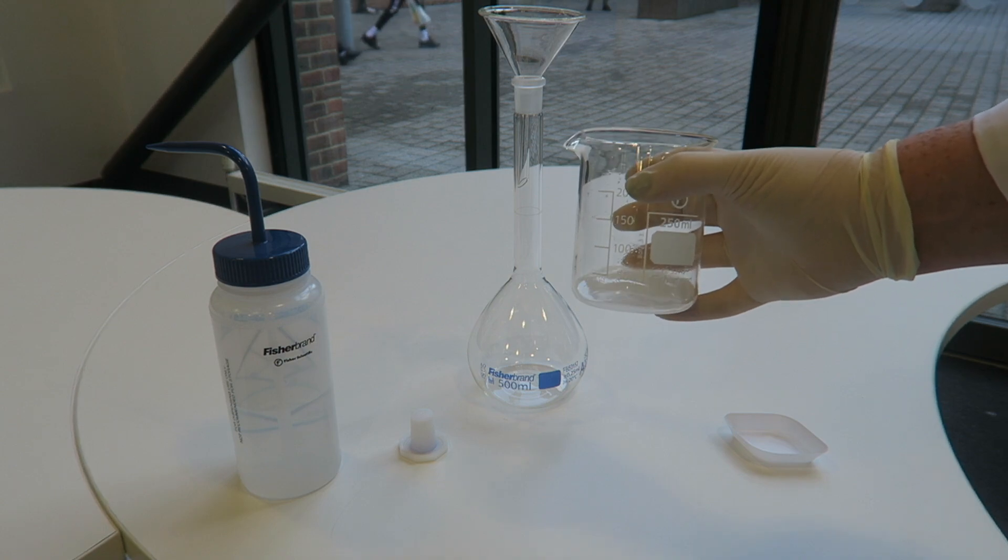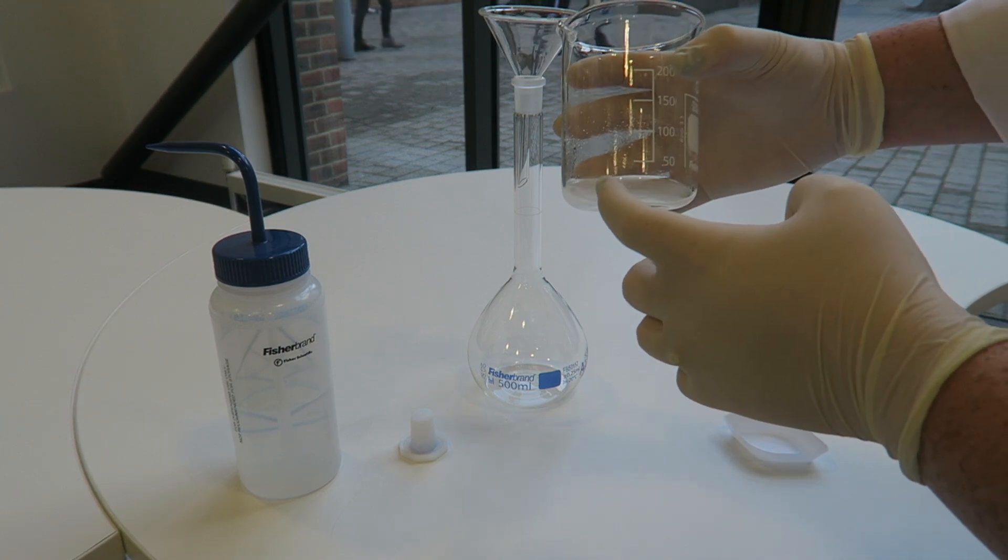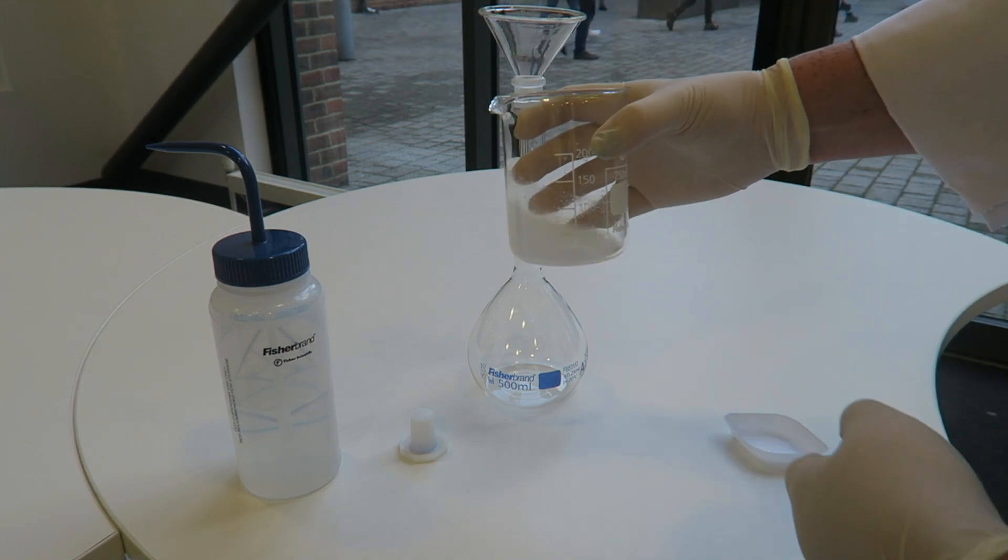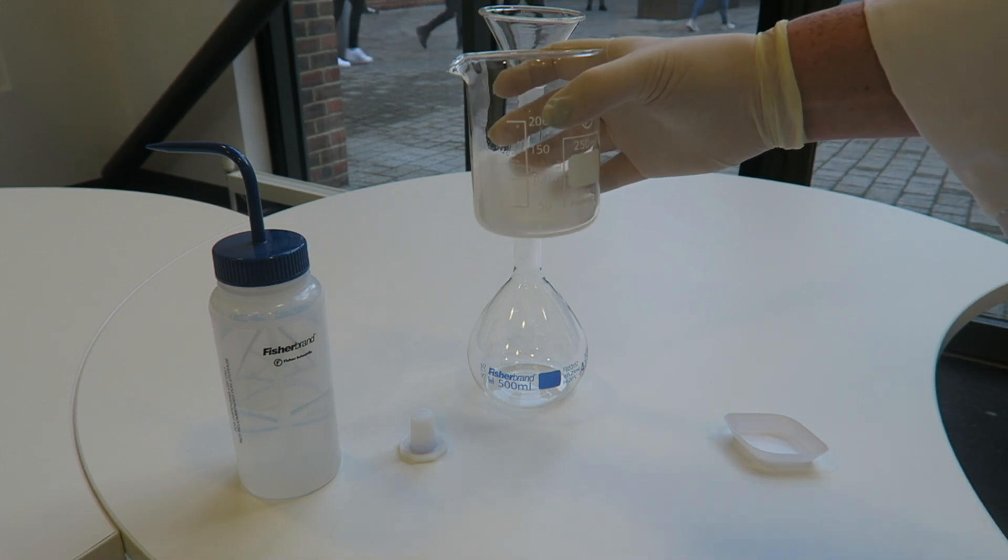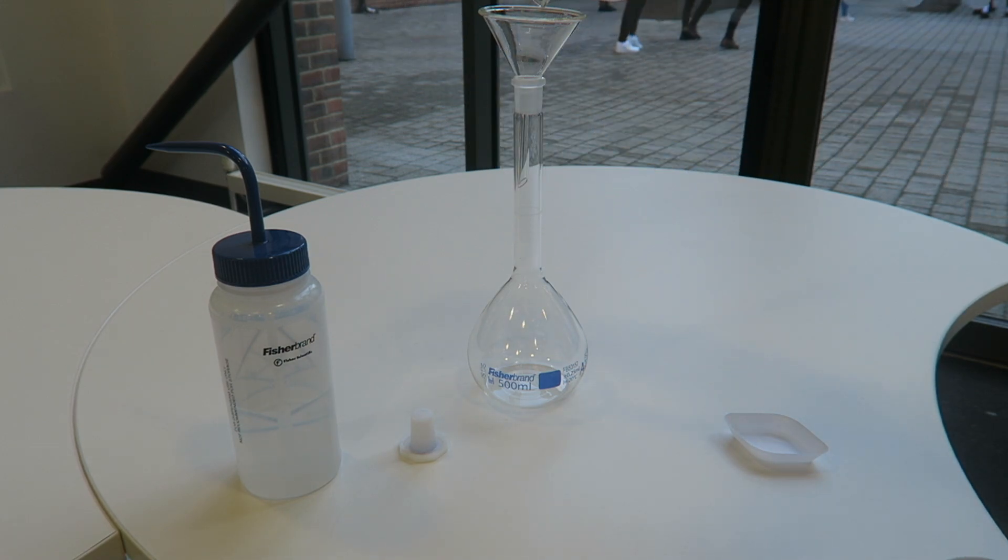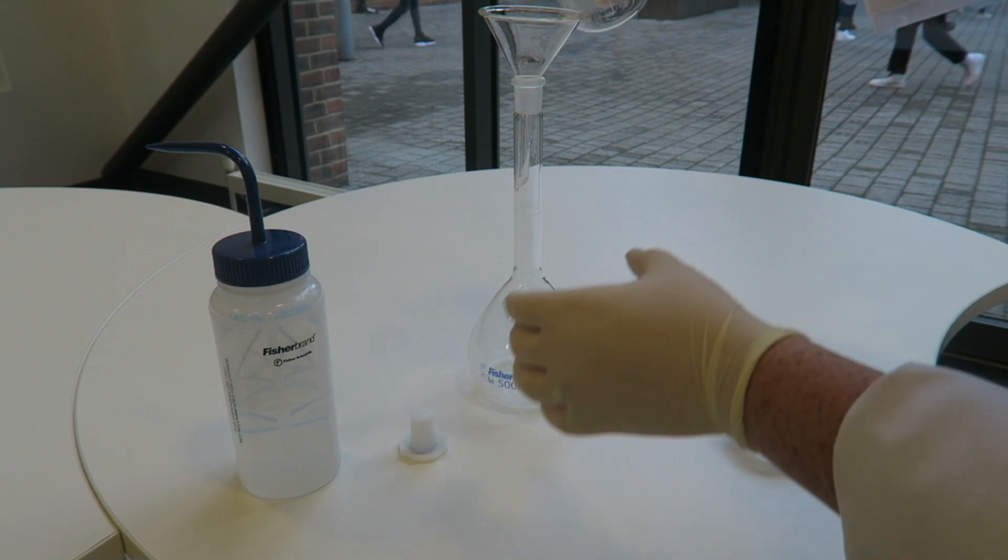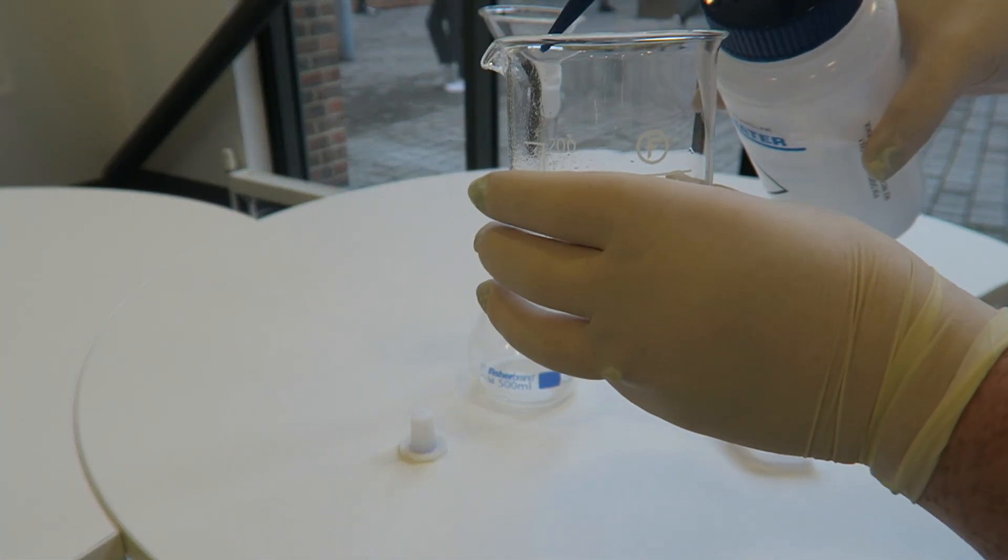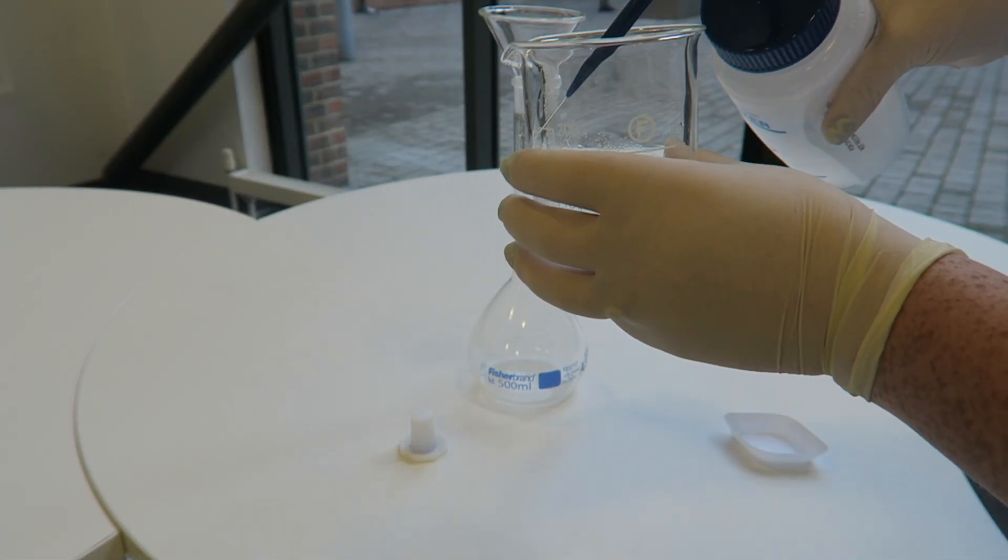Again, the key thing we need to focus on is getting all of the powder that is in here, all of the powder that we added, out into the volumetric flask. So I'm going to pour it in through the filter funnel. Then I'm going to put more water into the beaker.